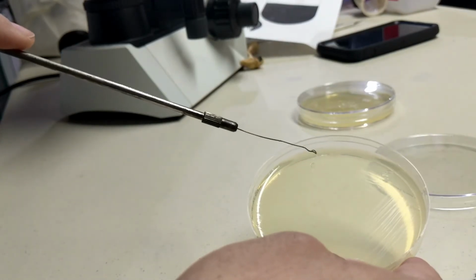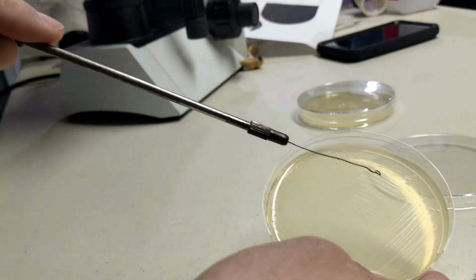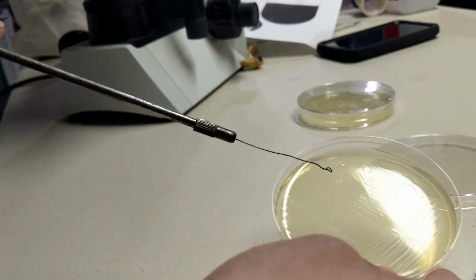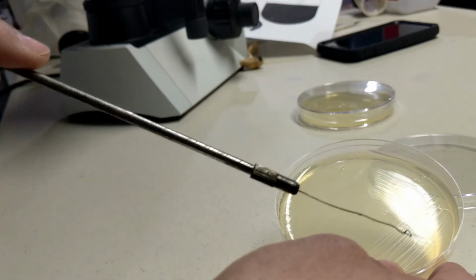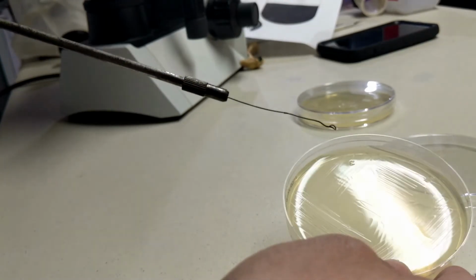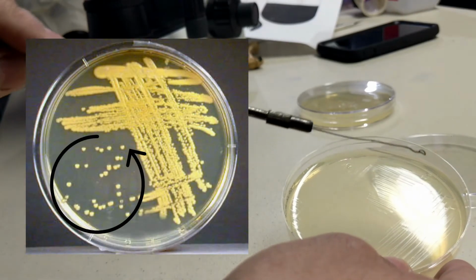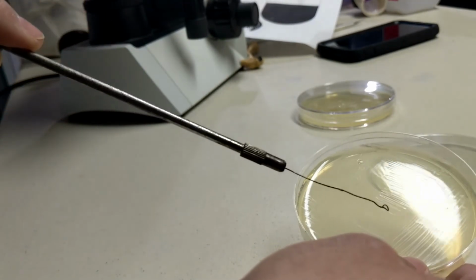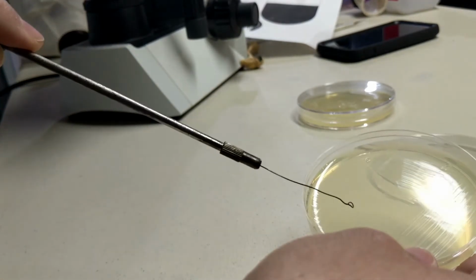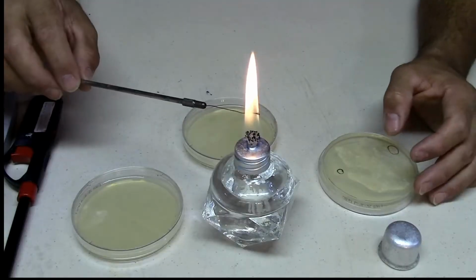We go from this one all the way to here, and we have this streak plate. I'm going to show you a plate where you can see the different colonies spread out, and this is pretty much what we want. All those colonies that maybe were combined, maybe there were 2-3 different bacteria, at the end we can isolate them.